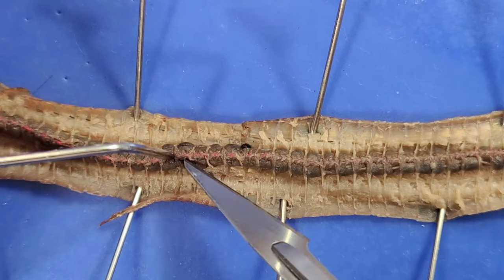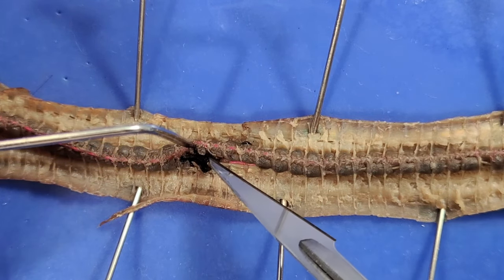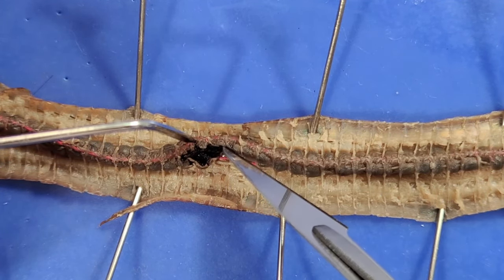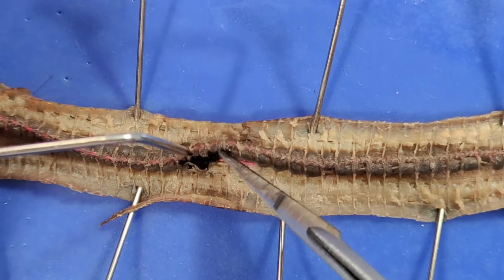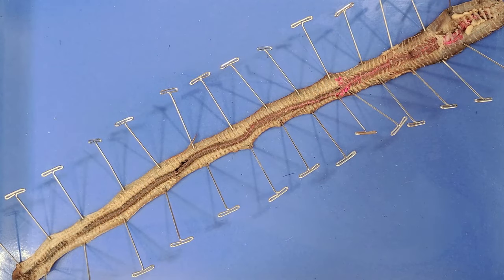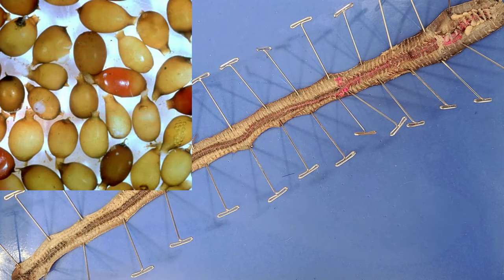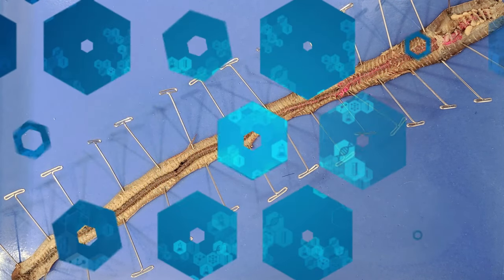Lastly, I'm just going to cut open the intestine, and you can see all the digested soil. That's the end of the earthworm dissection. Thanks for staying, folks. Here's a worm fact to send you on your way: worms lay eggs in cocoons which look kind of like tiny lemons. Each cocoon can contain up to 20 eggs, but usually only some of these eggs survive to hatch.